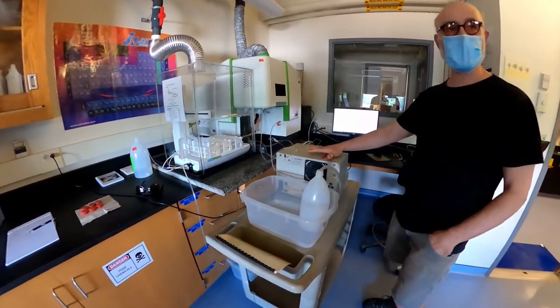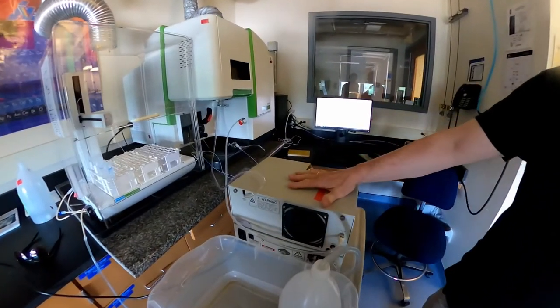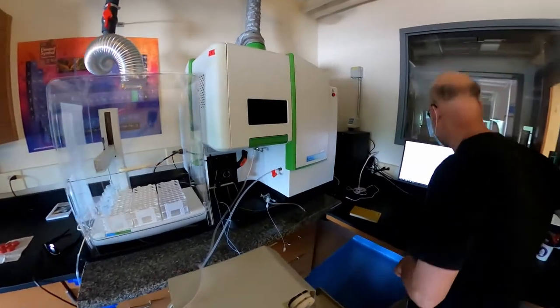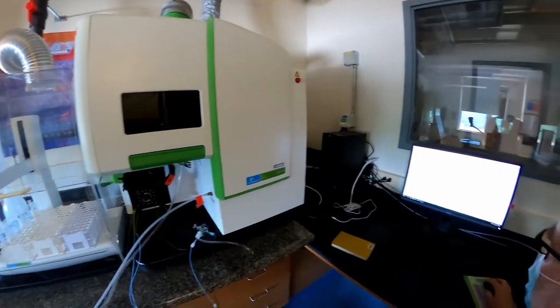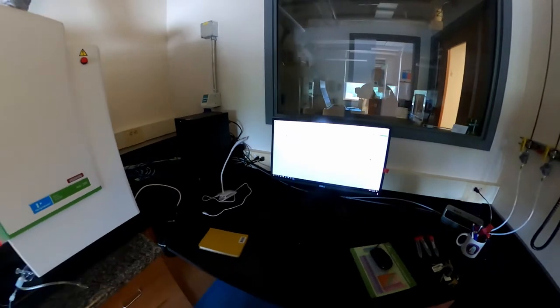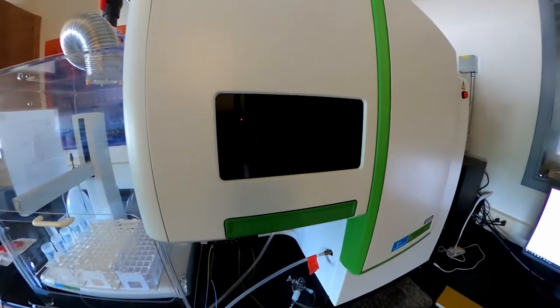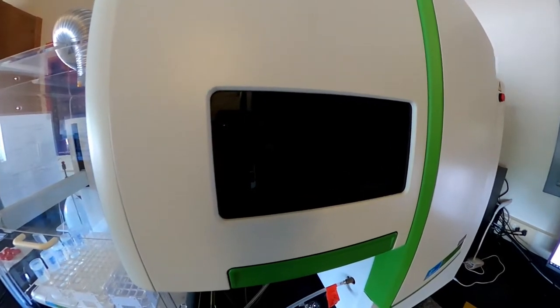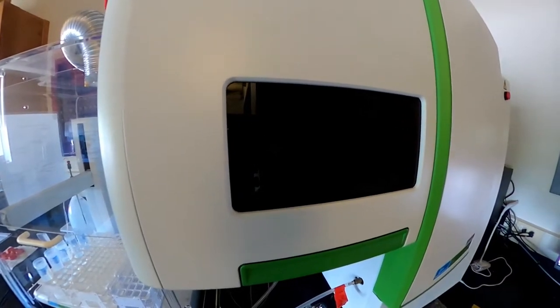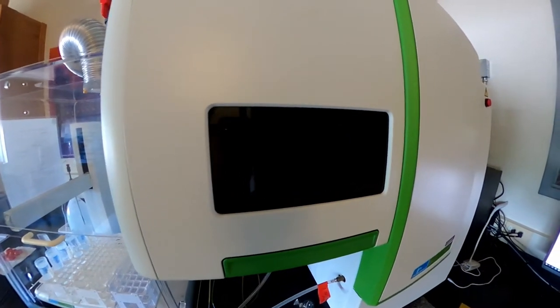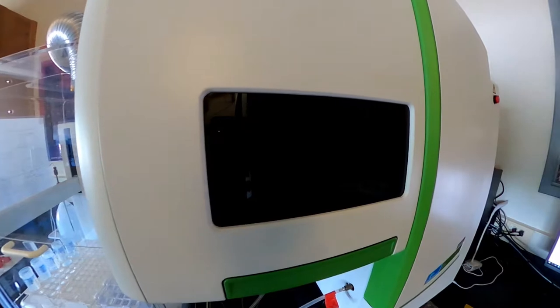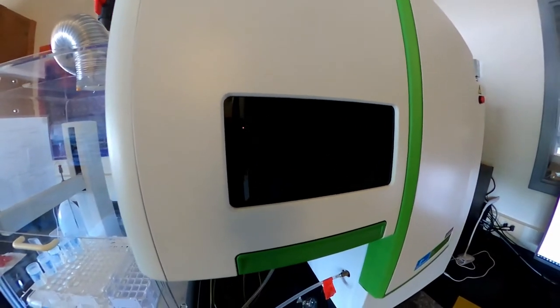And we have this special nebulizer that allows us to decrease our detection limits to the point at which we can look for lead in water. So right now I'm going to try to start this machine up. You've got to get the plasma started. And I'm going to go to plasma control here. And I'm going to turn the plasma on. This is about a 30 second operation. You might be able to hear the gas flow. You'll hear some ignition noises, some sparking. And then what you're going to see is a bright green plasma in there. It's probably green, actually, because there's a very thick piece of glass that's smoked in front of it. Staring at that plasma with your bare eyes would probably put an end of your vision on there. So we have that.